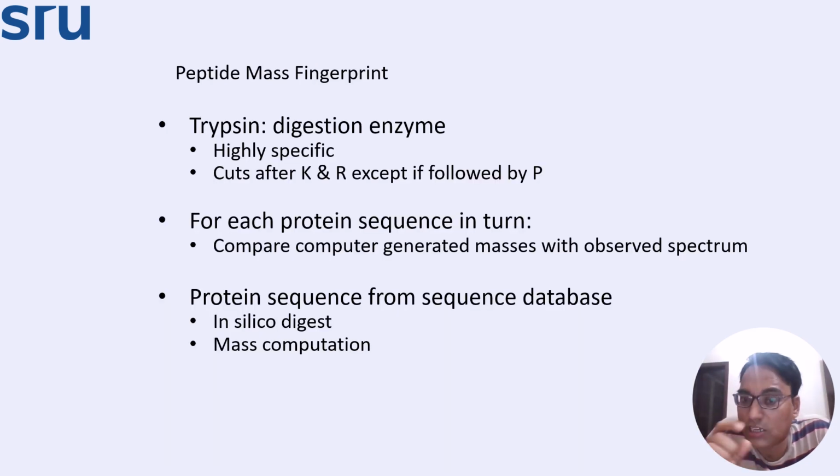Understand, students, one more thing: the charge by mass ratio, q by m, is normally used in agarose electrophoresis or electrophoretic instruments, where under an electric field molecules move depending on charge upon mass. Here it's m by z, mass upon charge. So that is the specific concept which is coming up. There also we use the electrophoretic mobility depending on the charge, or mass. Here also a similar concept stands, but we reverse the part.